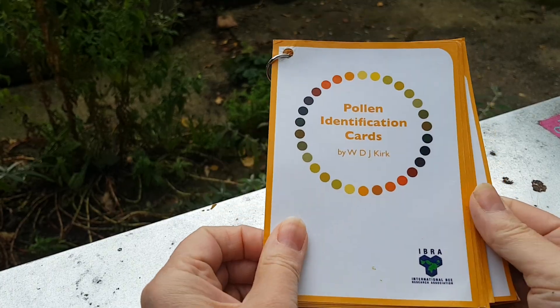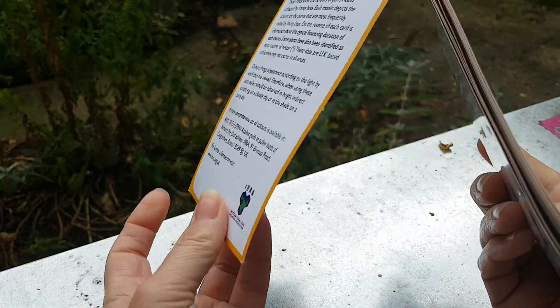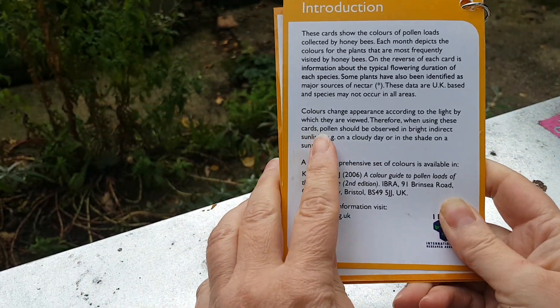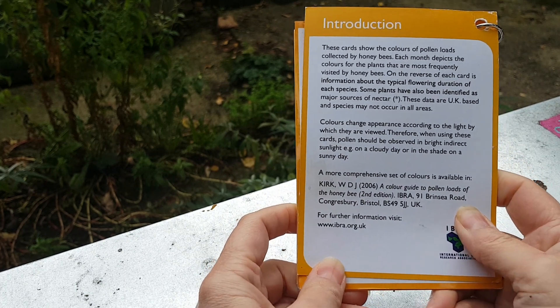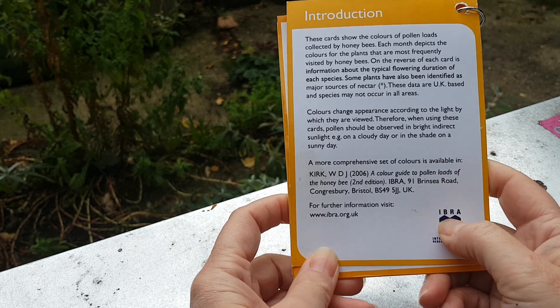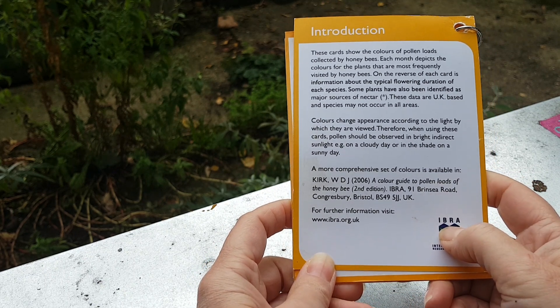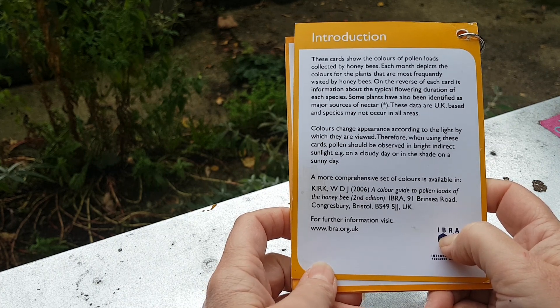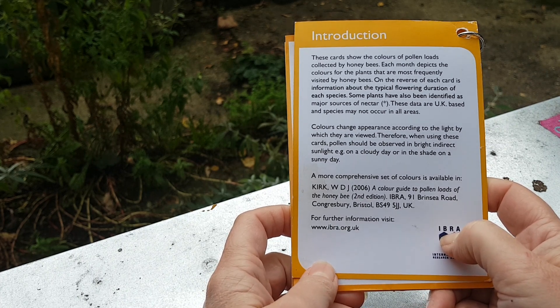Don't get me wrong, I think these are really useful. When you read this section here it says colours change appearance according to the light by which they are viewed. Therefore when using these cards, pollen should be observed in bright indirect sunlight — for example on a cloudy day or in the shade of a sunny day.